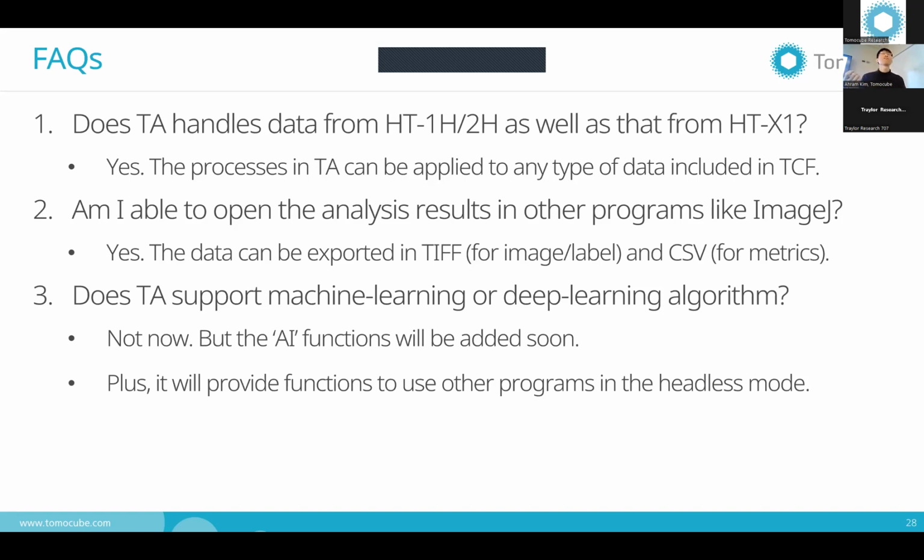And it's very bright, as if there are very high values, and when there is absorption, it is as if there is a blank, which is very blue.